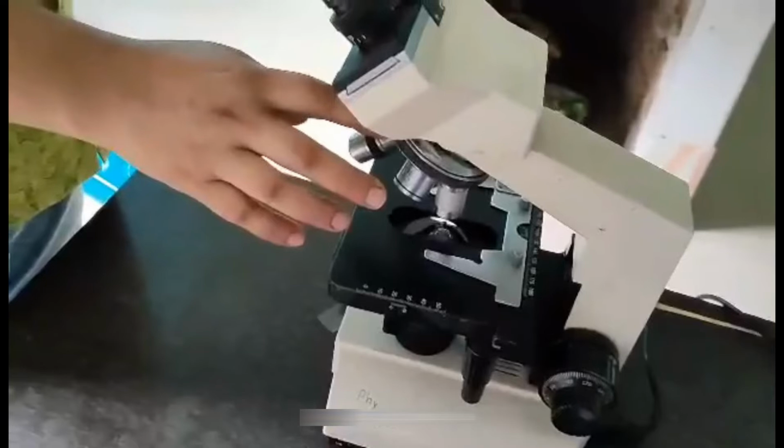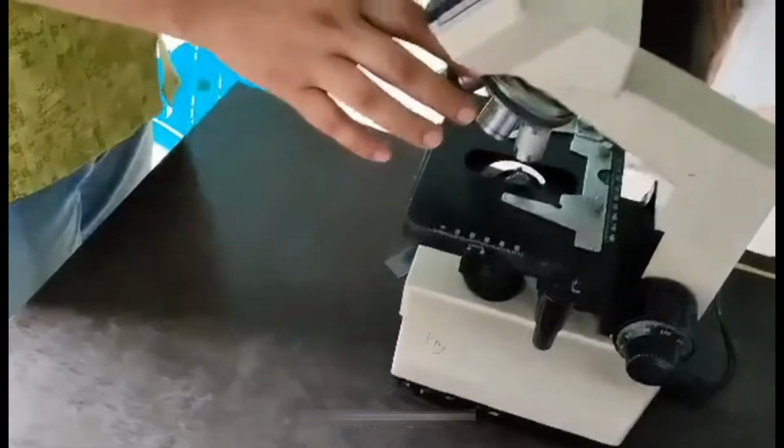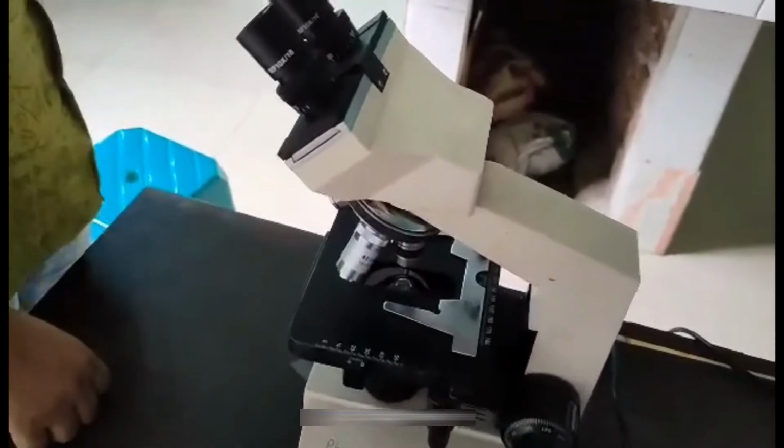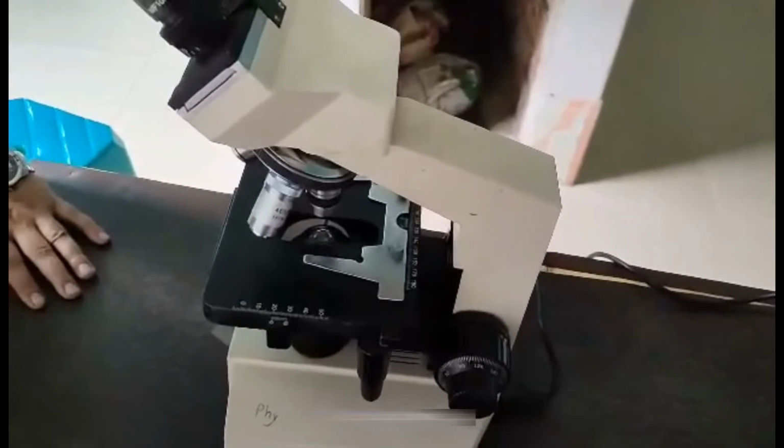And then the eyepiece body tube. Through the body tube, light passes to the eyepiece, and then the nosepiece. There are three lenses: 10x, 40x, and 100x. The 10x is used for the initial focusing and the total count of WBC. The 40x is used for the total count of RBC and the differential count of WBC, and the 100x is called the oil immersion.